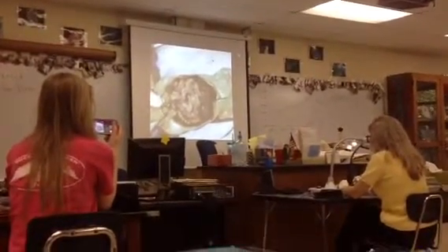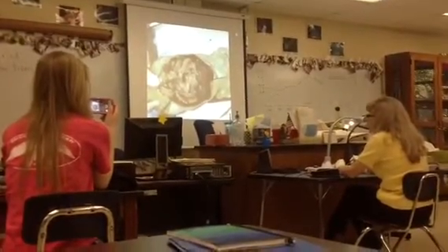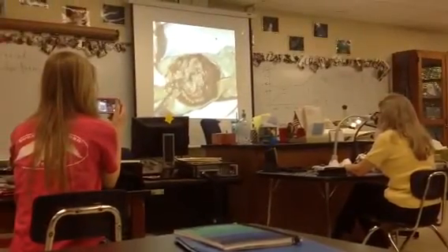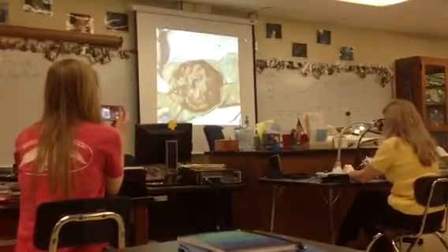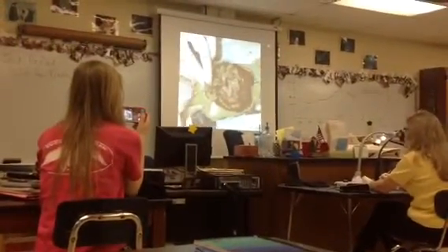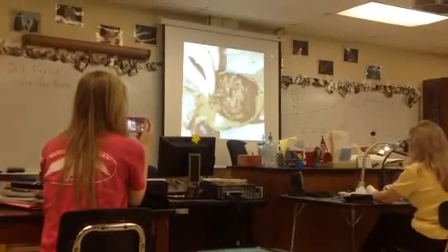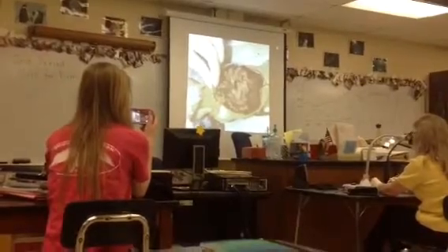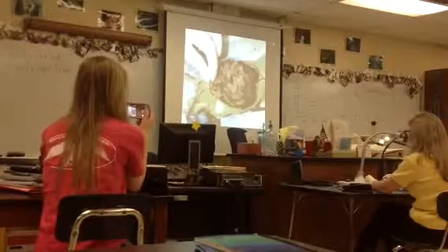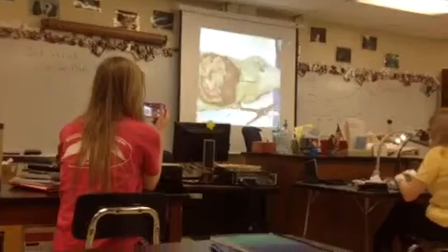This one's pretty much about the size most of them are, but it might be really, really small if there's no urine in it, or it might be a lot bigger than that if there is urine in it. So just know that that's going to be where the bladder is. Then this is the urinary meatus or the urethra. It's our first opening, the one closest to the head. Below that, that's the vagina. And then below that, that's the anus. So you have to know those openings. So urethra, vagina, anus. Then you've got to know your membranes.